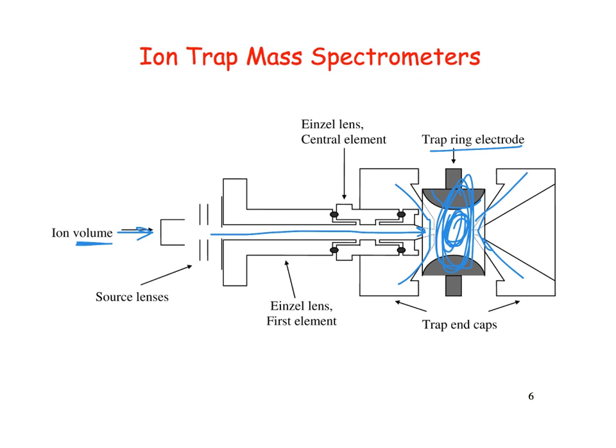And so our text talks about some different experiments and how they would change the voltages across these different electrodes. They can run experiments that look like our normal mass spec results. They can do experiments where they can set a high and a low cutoff for mass to charge ratio, and they can even make those very narrow so they could select essentially a single ion and just monitor that single ion.